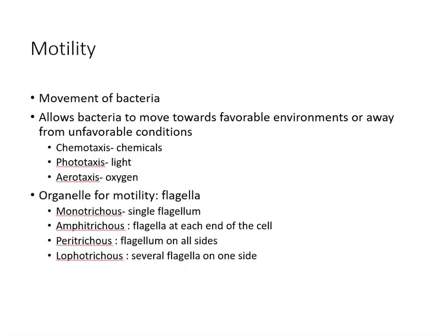Some bacteria are motile. Some are more motile than others. Can spread over an entire agar plate. But basically, you want to know whether these guys are motile, and usually they're by species. And this becomes important because if you have a motile organism and it gets into a certain area, it can move from one spot to another. Like you get some of these Proteus in UTIs and stuff like that, they're very motile.